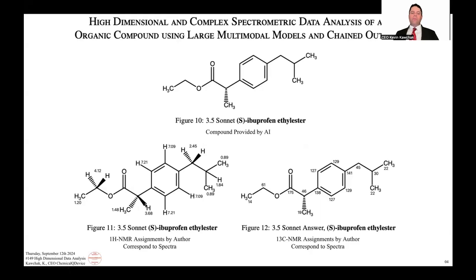Now, the way I figured out how to actually get to this, I did a 3D model online, and then I also did another one, kind of like a physical model too, is that there was a correlation between this hydrogen and this methyl here. However, you see they're on 2 different planes. So this is the proton coming out, this is the methyl in the back. And according to this Cahn-Ingold-Prelog, basically this assignment is, the ester would be number 1, phenyl 2, methyl 3. So that would be R. Now, since the hydrogen is not in the back on a dash, I had to flip that. So then this designation is S. So that's how I came up with that.